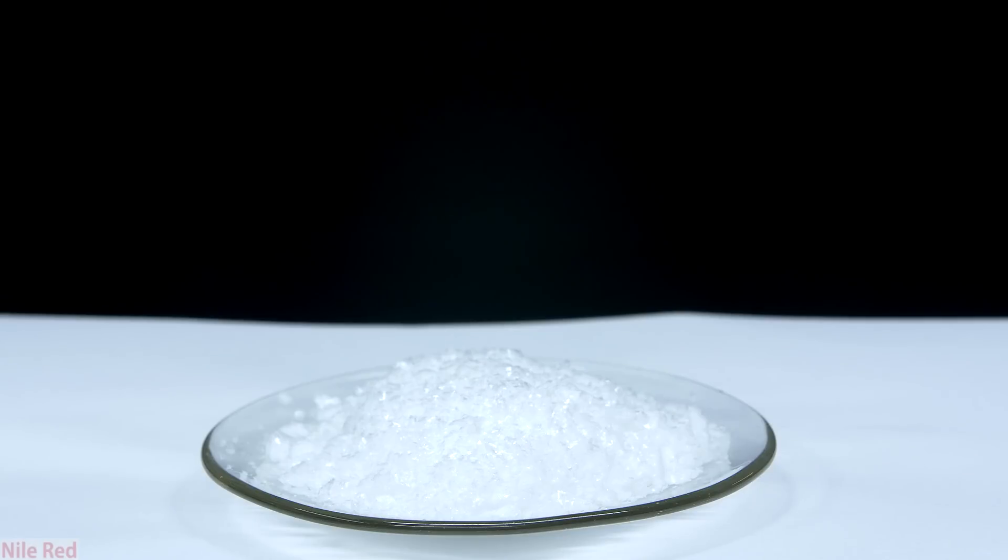Anyway, as I said before, this oxalic acid is eventually going to be used to make oxalyl chloride and then TCPO. Right now I'm just waiting on some glassware in the mail which I'm going to use to convert red phosphorus to white phosphorus, which is needed to make the oxalyl chloride. As usual, that's all I have to say for now and I'll see you guys on the next one.